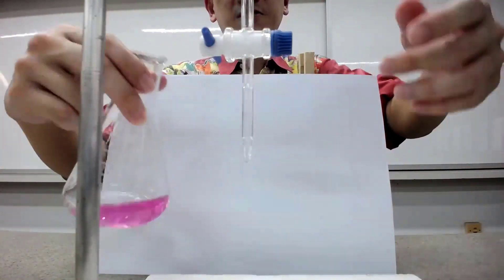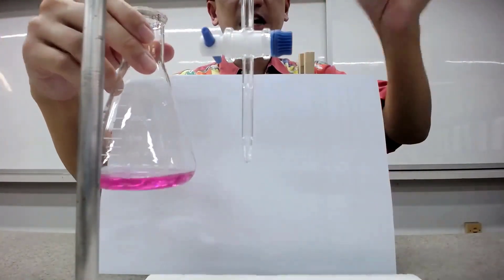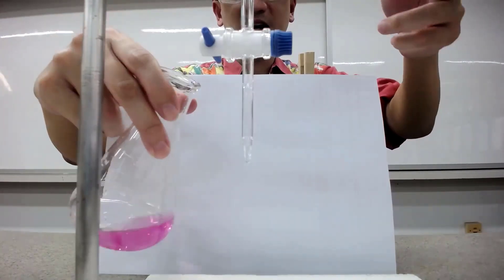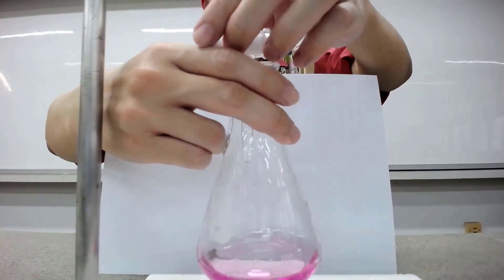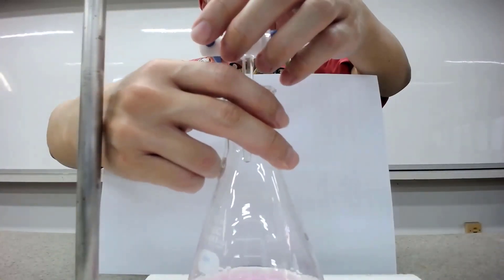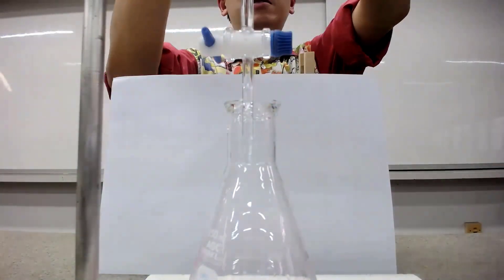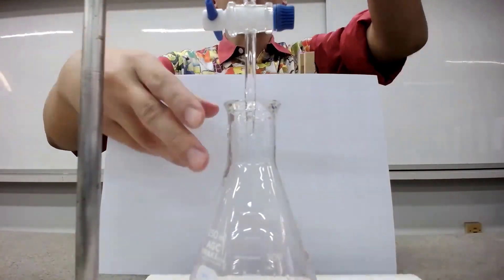Now the proper way to do titration is your master hand should be holding your conical flask, and then your non-master hand should be the one turning the knob. So I'm just going to position like this. I'm going to do the titration very, very quickly — just going to do a little bit of adjustment. I'm just going to adjust the burette a little bit higher so that you can see the soaring.